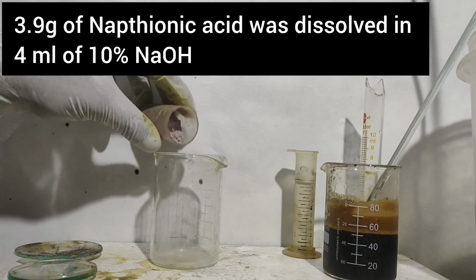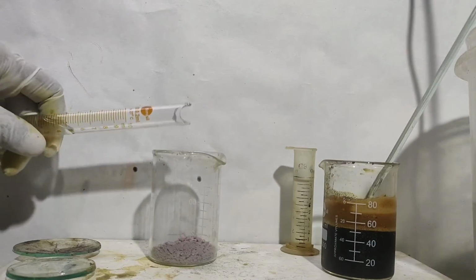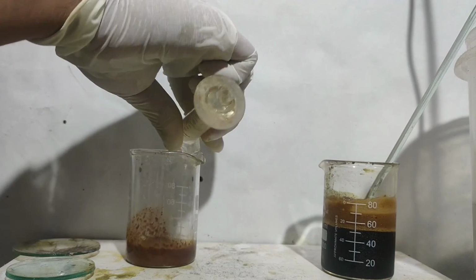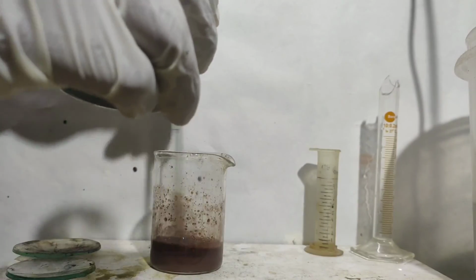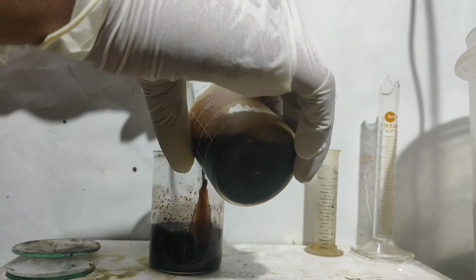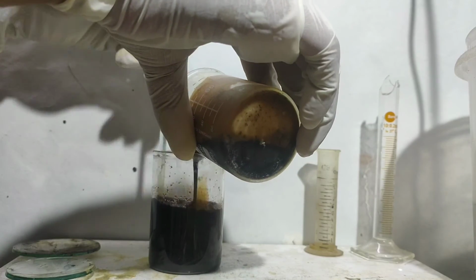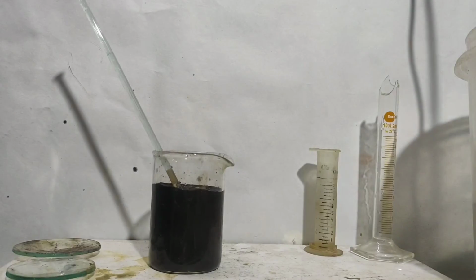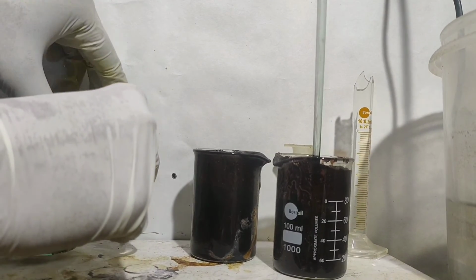After the addition was complete, I dissolved 3.9 grams of naphthionic acid and added 4 ml of 10% sodium hydroxide solution followed by 10 ml of distilled water. After the naphthionate solution was ready, I added the tetrazotized benzidine dichloride solution into the sodium naphthionate solution with constant stirring. The pH of the solution was around 5 to 6, so it was made alkaline with 3.5 grams of sodium carbonate.